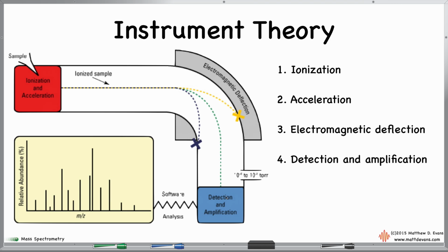It's seeing what comes out on the other side. This little part of this diagram is meant to represent a vacuum, so we always have to have a high vacuum pump attached to the mass spectrometer. For obvious reasons, we don't want our ions to be bumping into air particles, so that would be bad. So this has to be completely a vacuum. And in fact, if you look at our mass spectrometer, there's a gauge up there. It reads the pressure in torr, and it's a really low torr reading, okay? And that runs all the time. We always have that on.